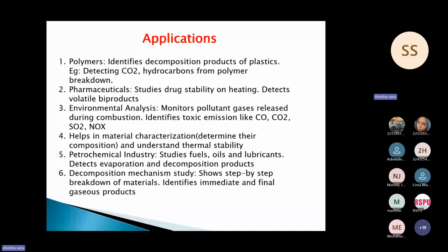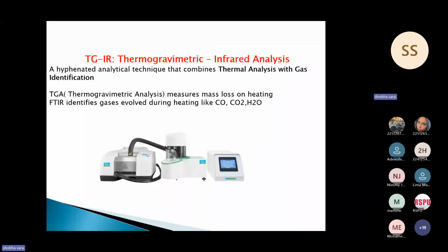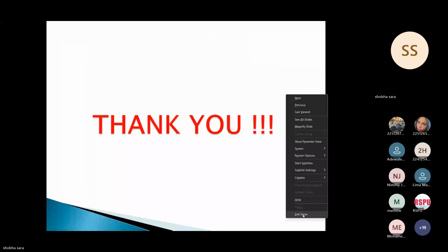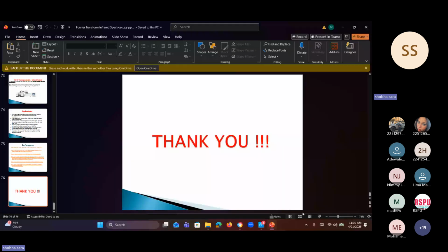Petrochemical industry, which studies fuels, oils, lubricants. Then decomposition mechanism. It shows the step-by-step breakdown of materials, intermediate stage, starting, and the end, and the final gaseous products. So the applications are really good. These are the advanced techniques. Done. I hope you understood and it was clear.